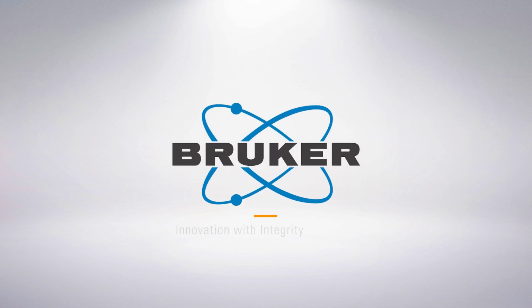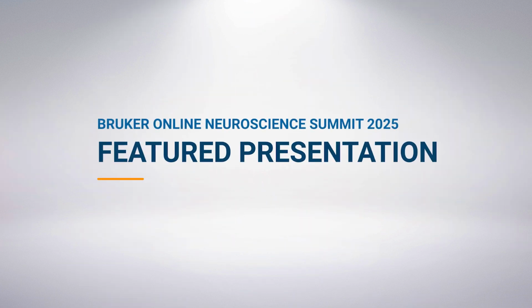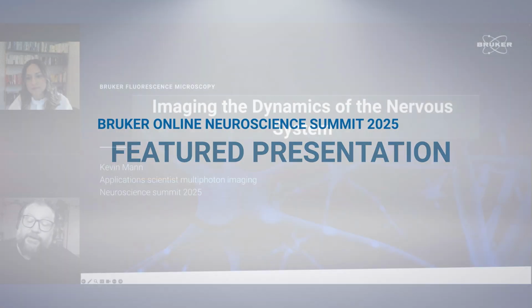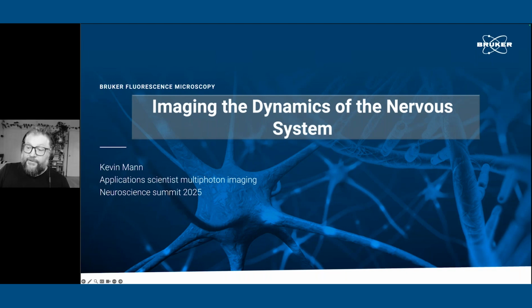We've seen some interesting talks about the actual science that people are doing with our systems. And I wanted to take a step back and look at the technology that underlies this. I realize that a lot of people here maybe are not as familiar with multiphoton imaging or the different methods that we use for multiphoton imaging, for optogenetics, for example, or for large field of view imaging, for deep imaging, and for, of course, some of the things that I'll talk about at the end, ultra-fast imaging.